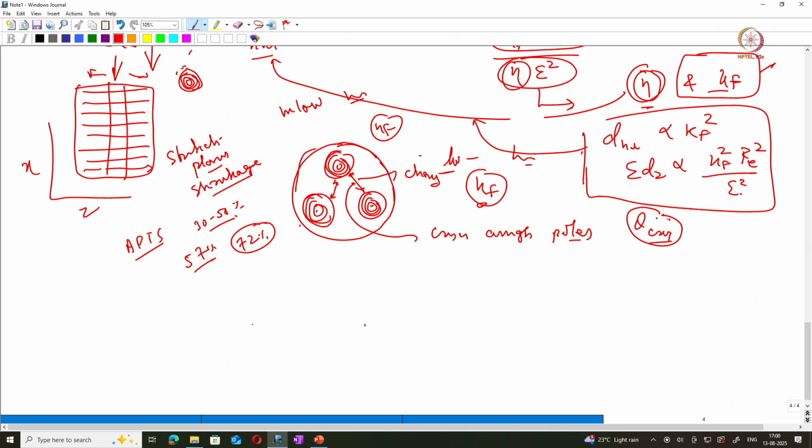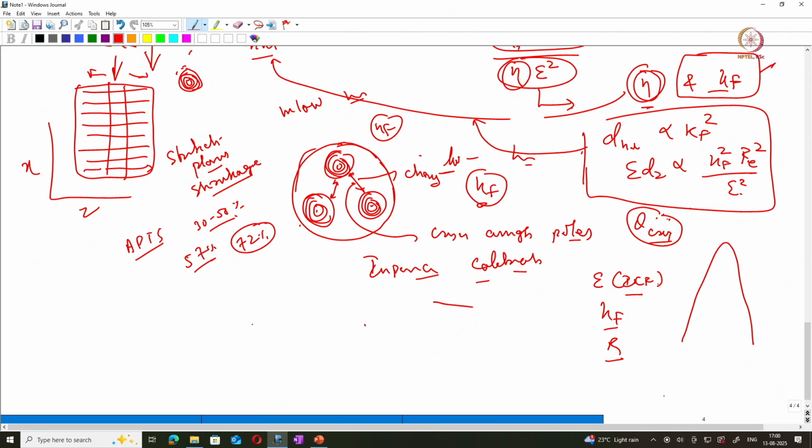So with this, what we got is the importance of calibration. What is the importance of calibration? You can see that by experiments, the xi value, ICF, KF values, R, these are all variables. These are all changing with the experiments that are performed. That's why calibration is very important to get a reconstruction which exactly mimics whatever tip volume you are analyzing, so that you minimize the distortions during the reconstruction and your analysis will be optimum.